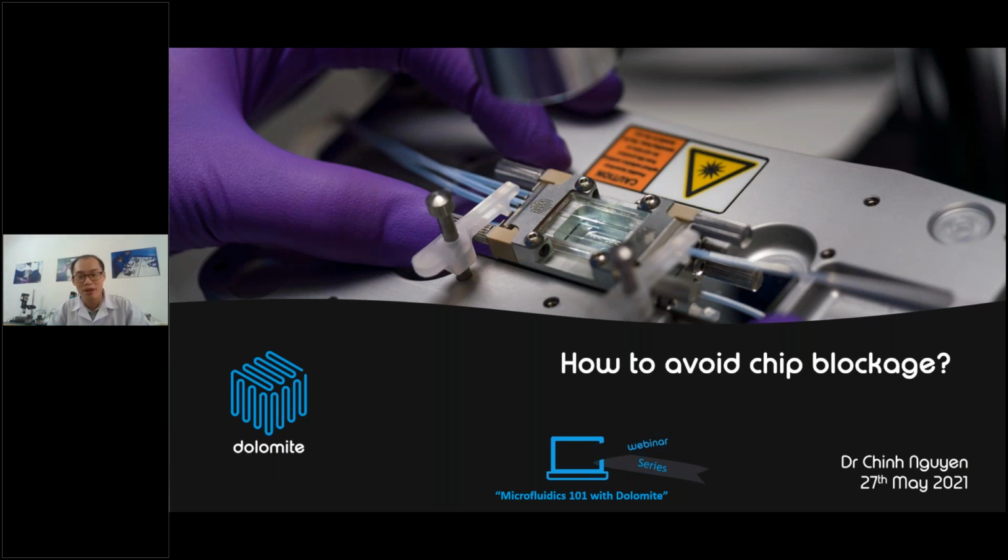So today, the topic we are talking about is chip blocking and how to avoid chip blockage. Chip blockage is an event that any microfluidic researcher never wants to occur. Unfortunately, this does happen sometimes, especially when working with narrow channel microfluidic chips and polymeric solutions or cell suspensions. So today's session will focus on some ways to avoid this painful experience.